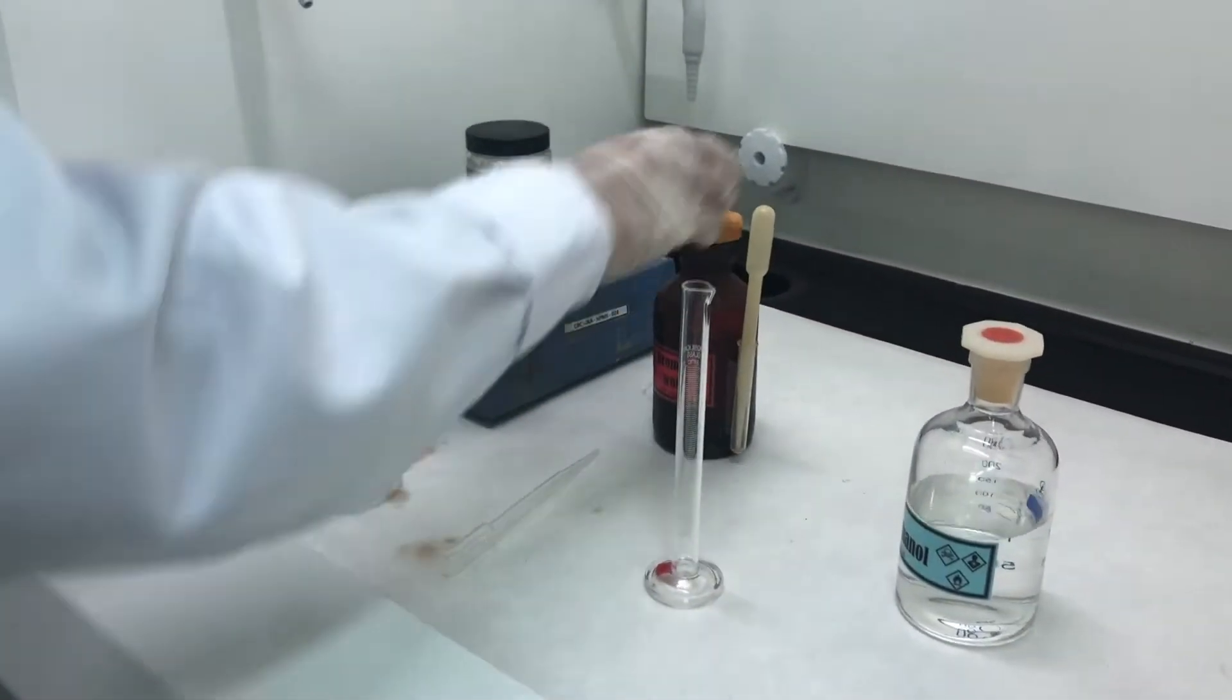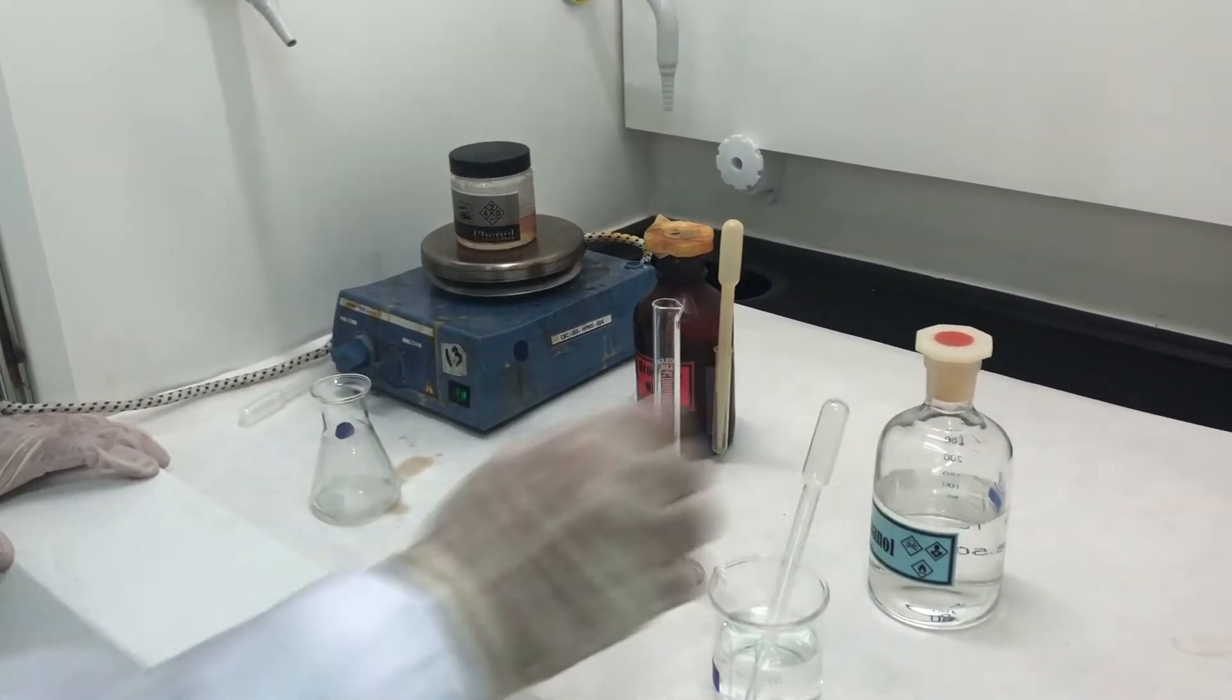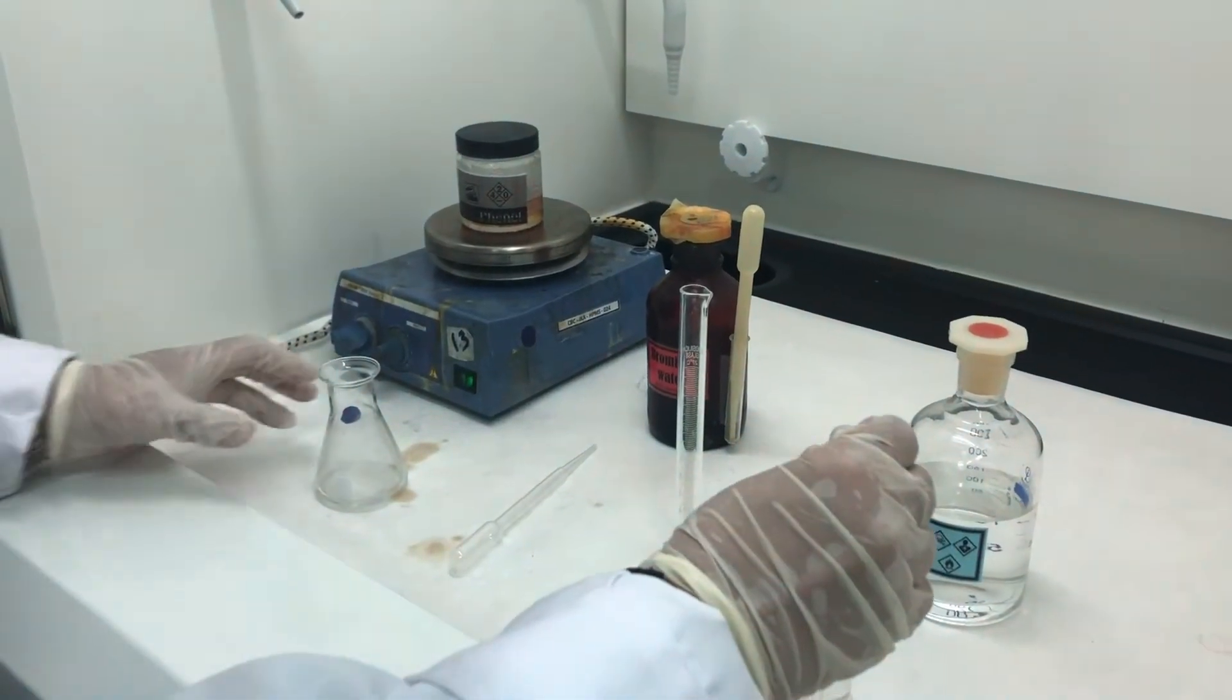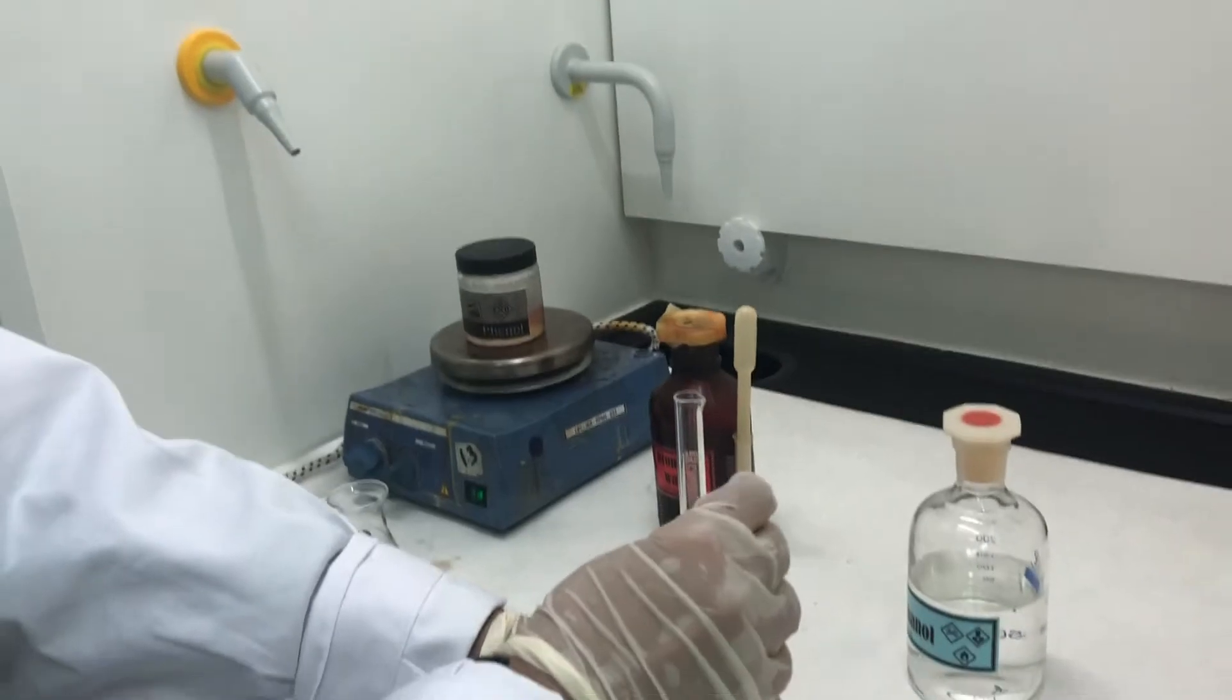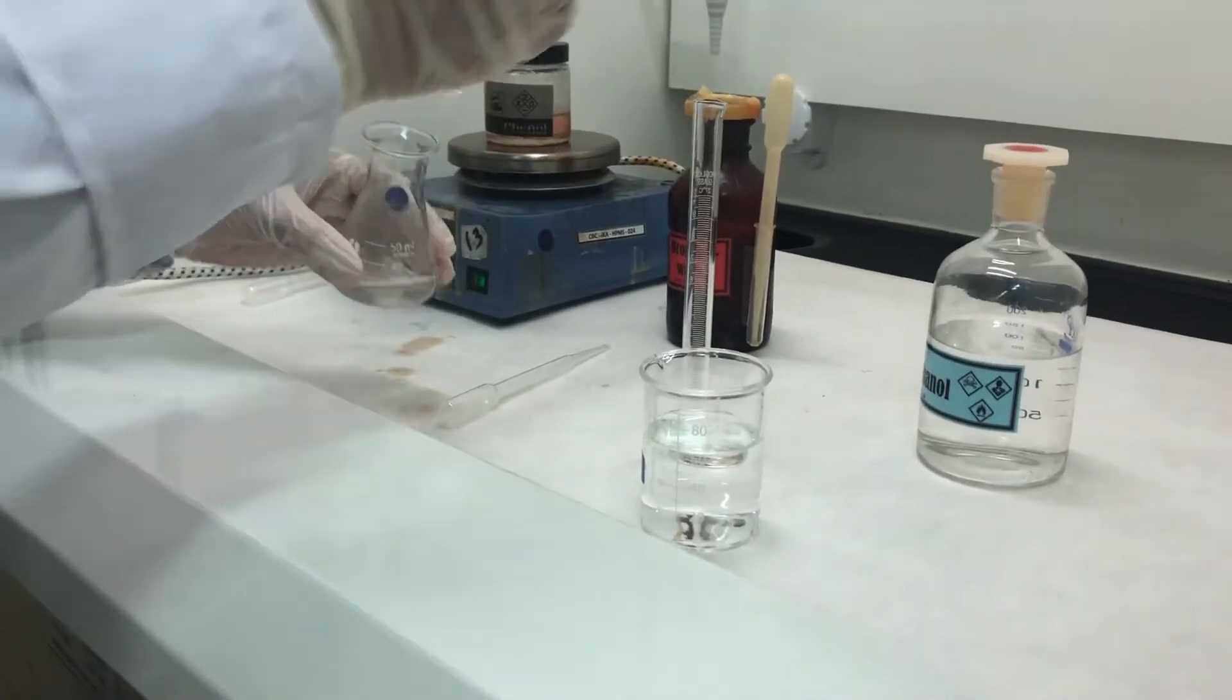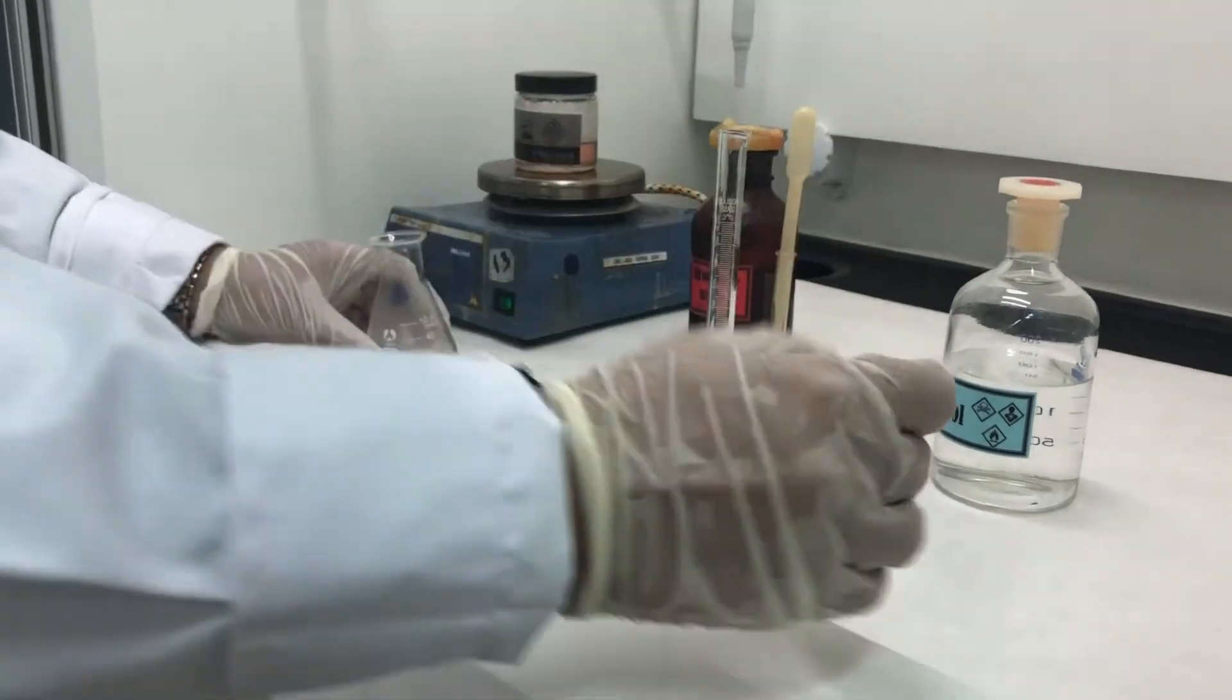Now, coming to the third step, where I am going to add the bromine water. As you know, bromine is highly corrosive. Okay, before that, I need to add around 5 ml of water to make it more diluted, since we are going to add the bromine. I have just added 2.5. I need to add another 2.5 here. So I have added water.